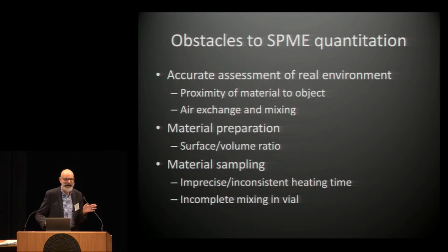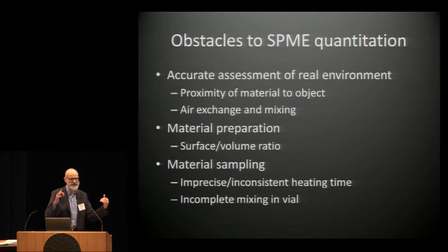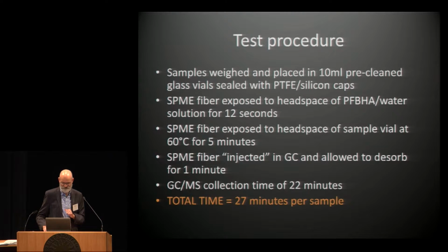So that being said, I generally have found that quantitation is not necessary for the most part for these kinds of tests, because we're more interested in whether it's a good material or a bad material. And if it's a bad material, we don't want to argue with it and decide, okay, it's okay as long as it is 6 inches away and not 2 inches away. So we don't want to get into that. So if it's good or bad is sufficient.